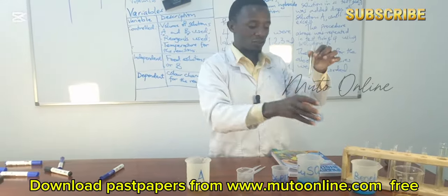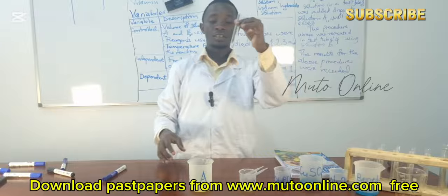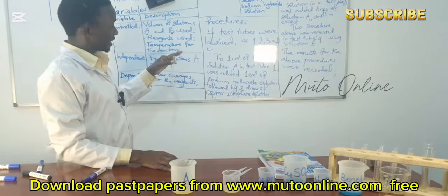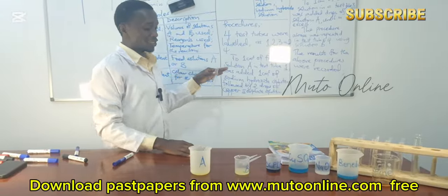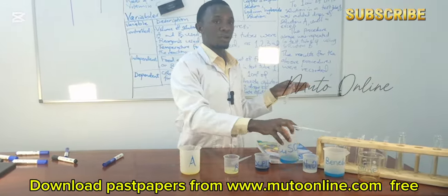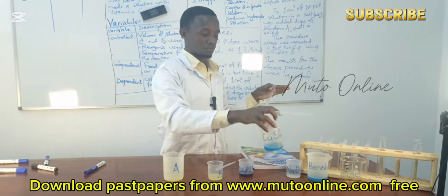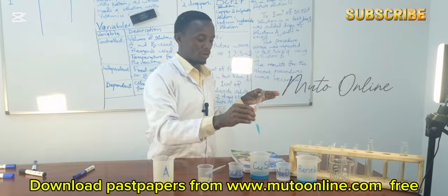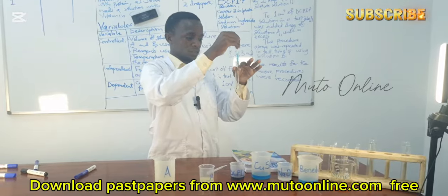Equal volumes. To the same amount, you're telling us to add 2 drops of copper 2 sulfate. Here's my copper 2 sulfate. So I'm adding 2 drops of copper 2 sulfate.